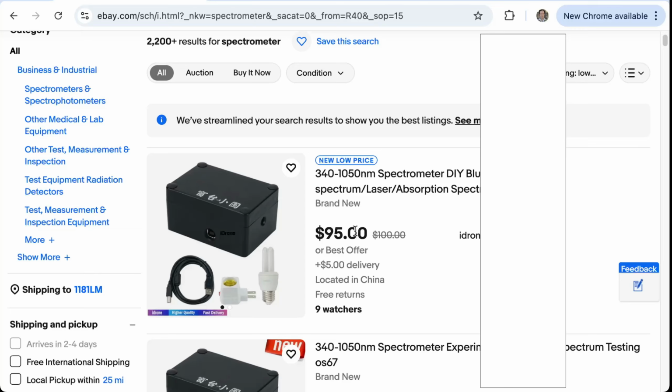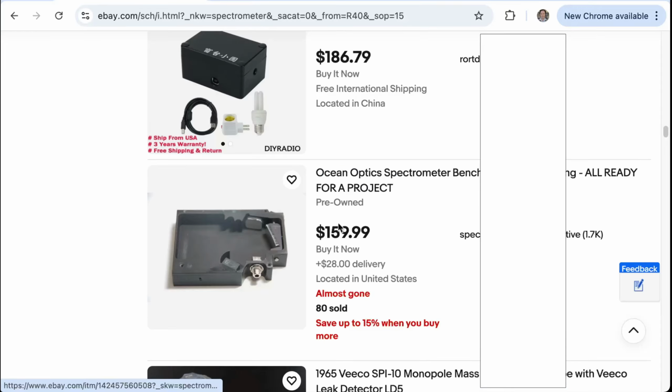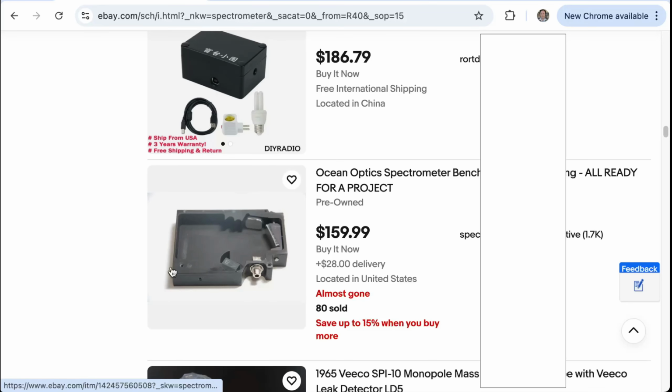I saw some reviews of it and they are pretty good, but interestingly in the original reviews the price was about $50 US, so maybe the prices are increasing. So this is the lowest price I see on eBay now. This picture is interesting. You can see how the spectrometer actually looks. Here we can see the optical input, here we can see a grating and a mirror, so inside it is not very complex and you only need to add the camera and you get a spectrometer.